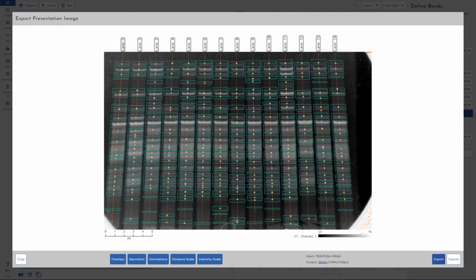So this basically is like a scale bar to show you what is signal and what is background. So obviously in this image, our bands are light, so we would call that high, an area of high intensity, it's the signal. Whereas all this area around our image that is in the background is noted as background, so it's the low end of the spectrum. And we also include different measurements of scale bars, but within this tool as well, you've got a lot of control over how you present this.